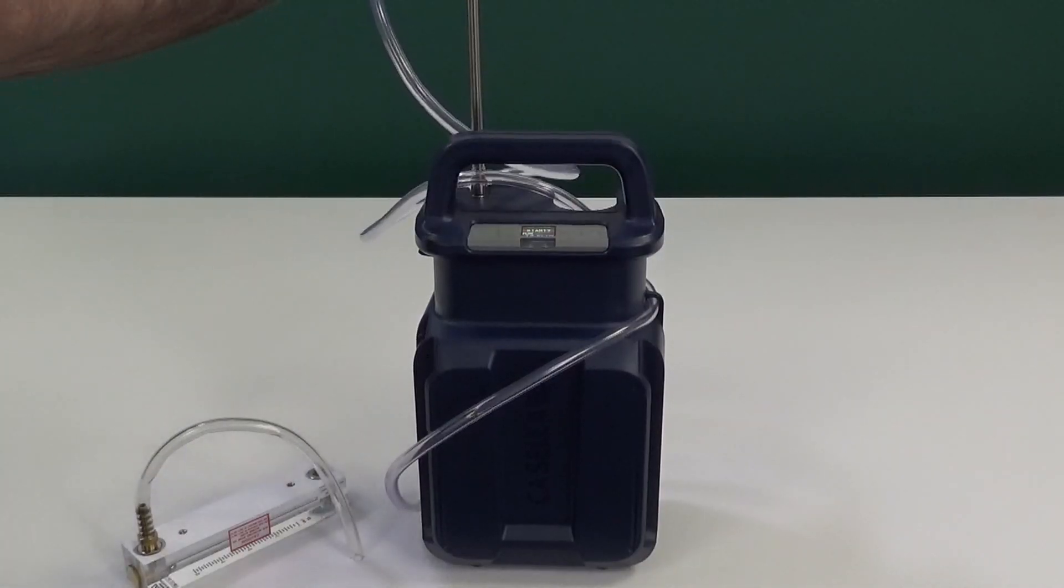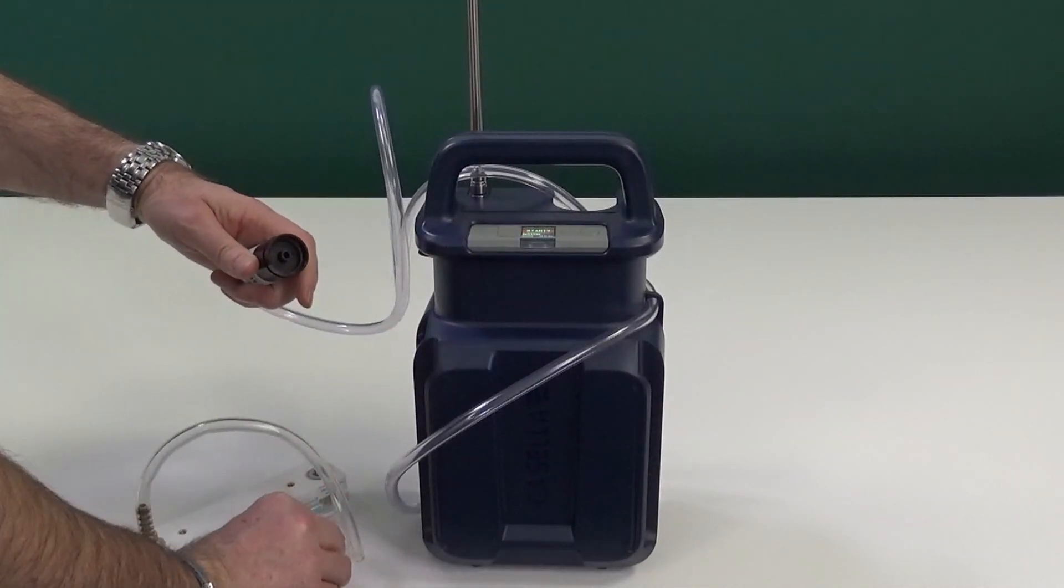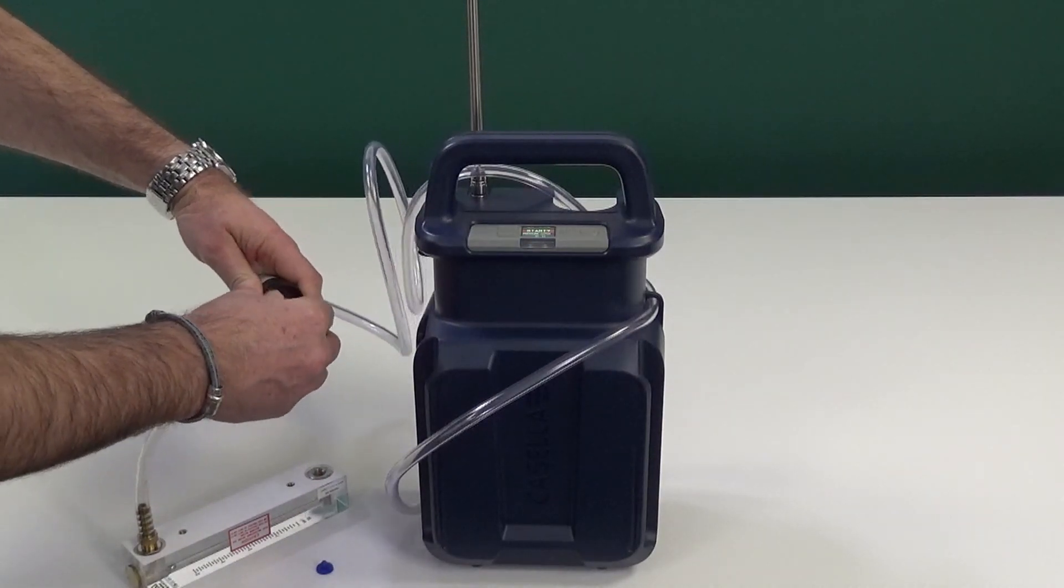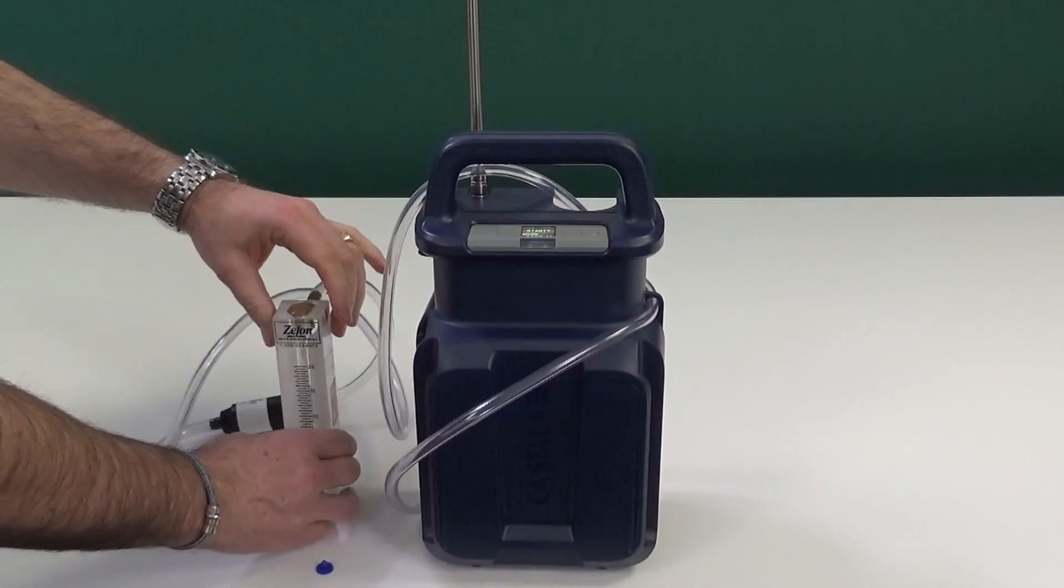To assemble the sample train ready for calibration, attach the sampling head to the rotameter. Note that the rotameter goes before the sampling head, not between the sampling head and the pump. Ensure the connections are secure to prevent leaks.